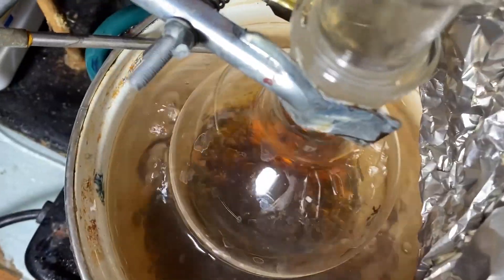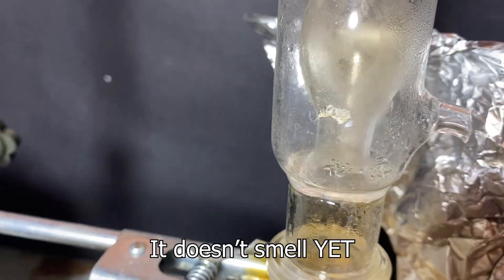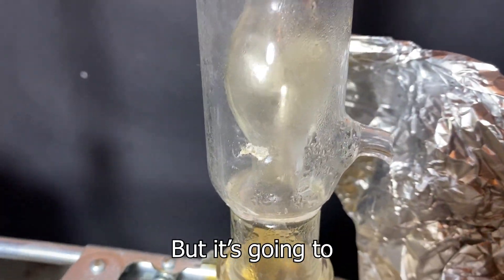There's already some crystals — can you see this? There's crystals there. That's good. There's a faint look of bromine here. It doesn't smell yet, but it's going to.